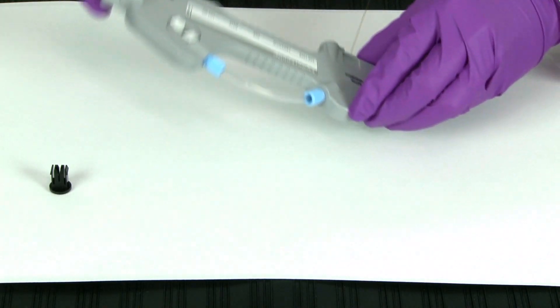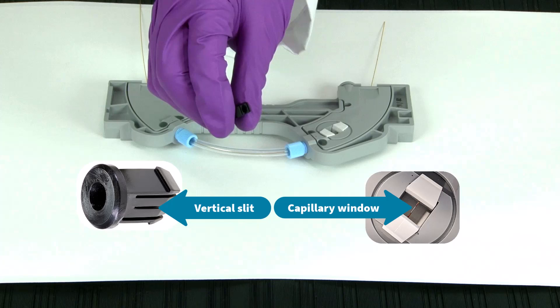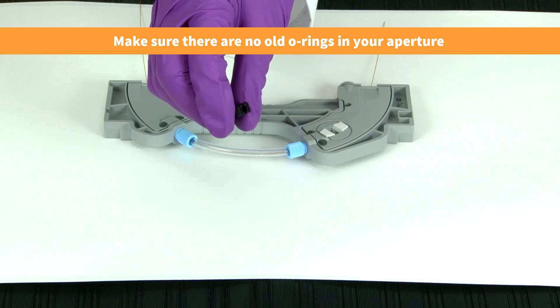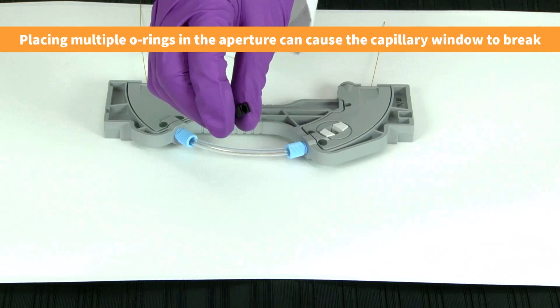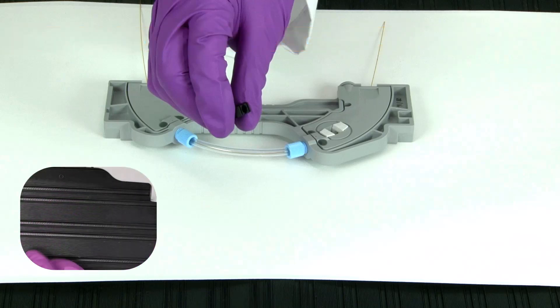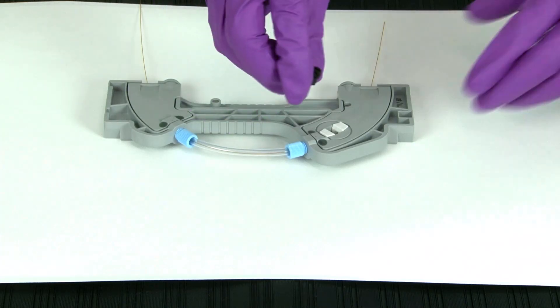To begin, flip the cartridge over. Ensure that the vertical slit in the aperture lines up with the length of the capillary window, which should be centered and visible through the cartridge window. Make sure that there are no old o-rings already seated in the aperture before installing the new aperture o-ring. Placing multiple o-rings in the aperture can cause the capillary window to break. Firmly tap the aperture on a hard surface to remove an old o-ring. Push the aperture completely through the cartridge window.